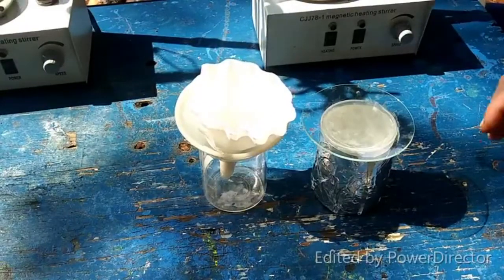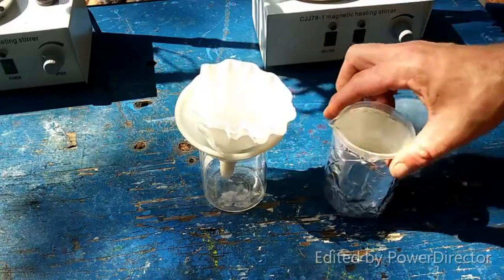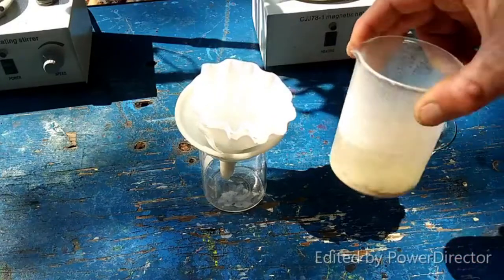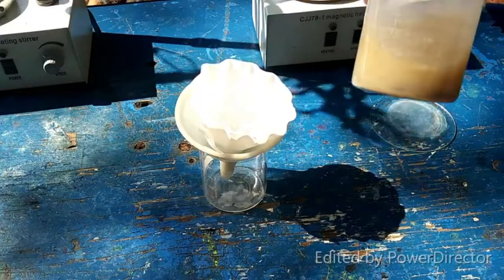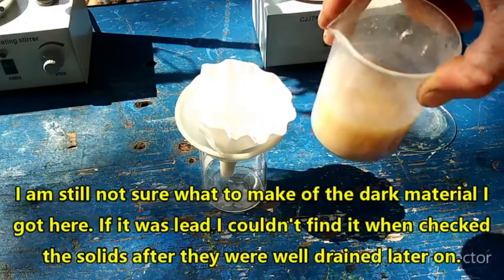Okay everybody, it is the next day because boiling this took a little longer. I just don't think the temperature was high enough at first, so I let it boil for a couple hours at a higher temperature. You can see that not all of the lead quite reacted, but a lot of it did.